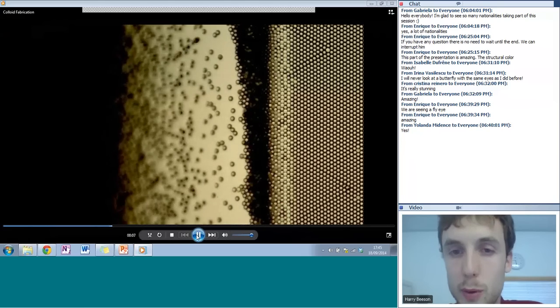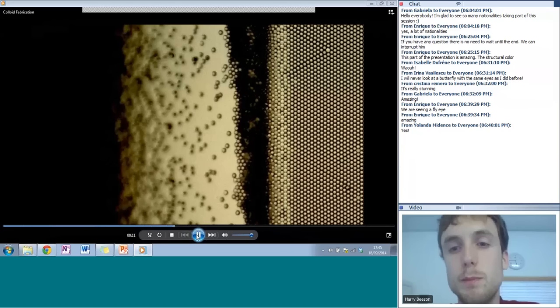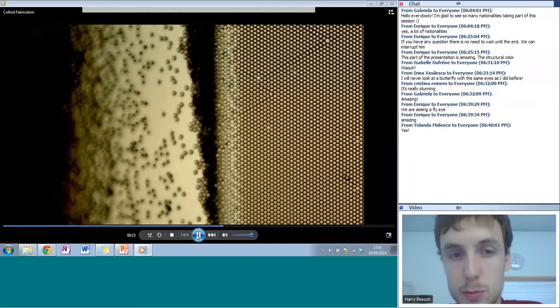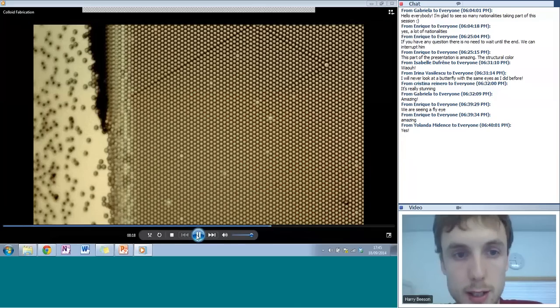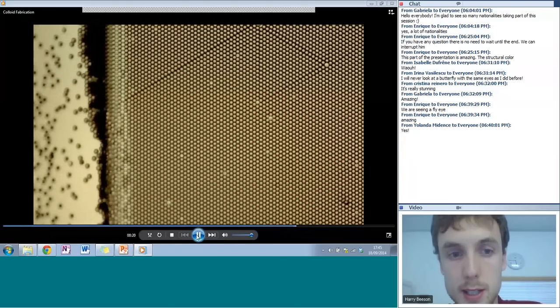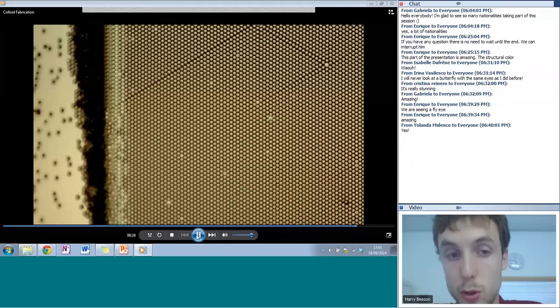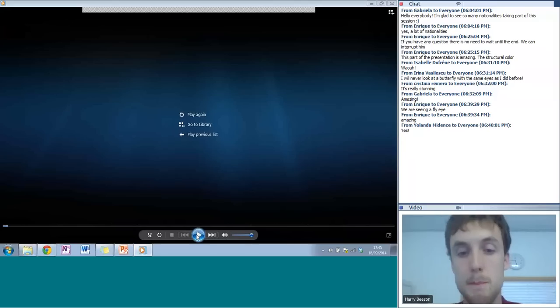I should say, this is actually using slightly bigger polystyrene spheres than we normally do. We've cheated here so that you can see it under the optical microscope. Because with an electron microscope, it has to be under vacuum, so you couldn't image this under the electron microscope because you need the water to be in liquid form. But it's exactly the same process that we use with the same polystyrene spheres, but with a much smaller diameter. And you can use the same process to get nanoscale opals as well.